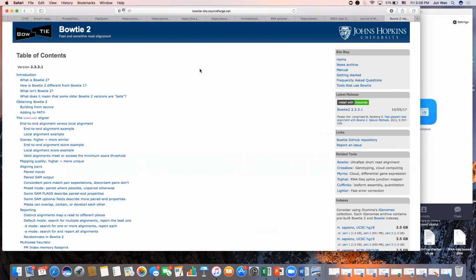This one is based on the Burrows-Wheeler transformation, but it's an updated version of it called the FM index. Okay, there was another paper that came out a couple of years later that proposed another algorithm for how to condense this genomic information and make it so you can work with it very well. You'll find it to be very fast. It's much faster than BWA, and it's different than STAR, but I think the speed is really comparable to STAR.